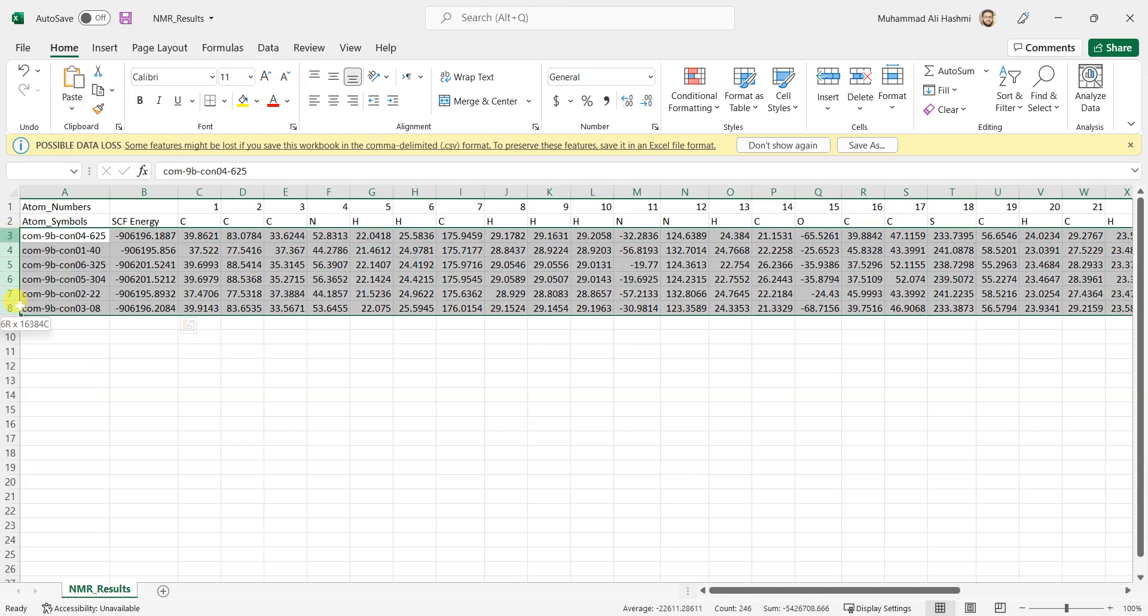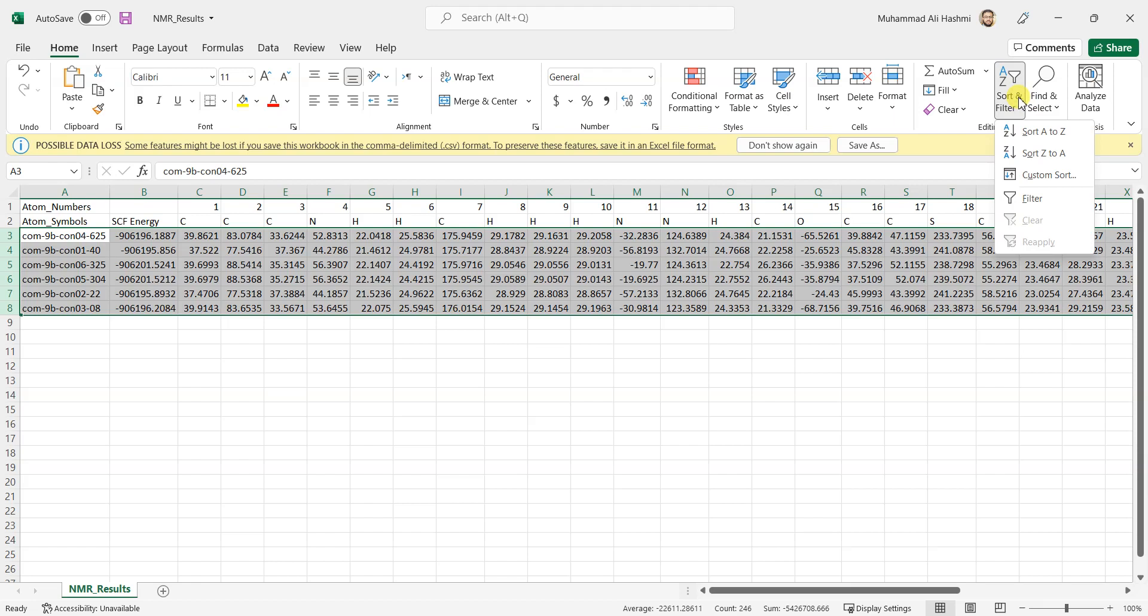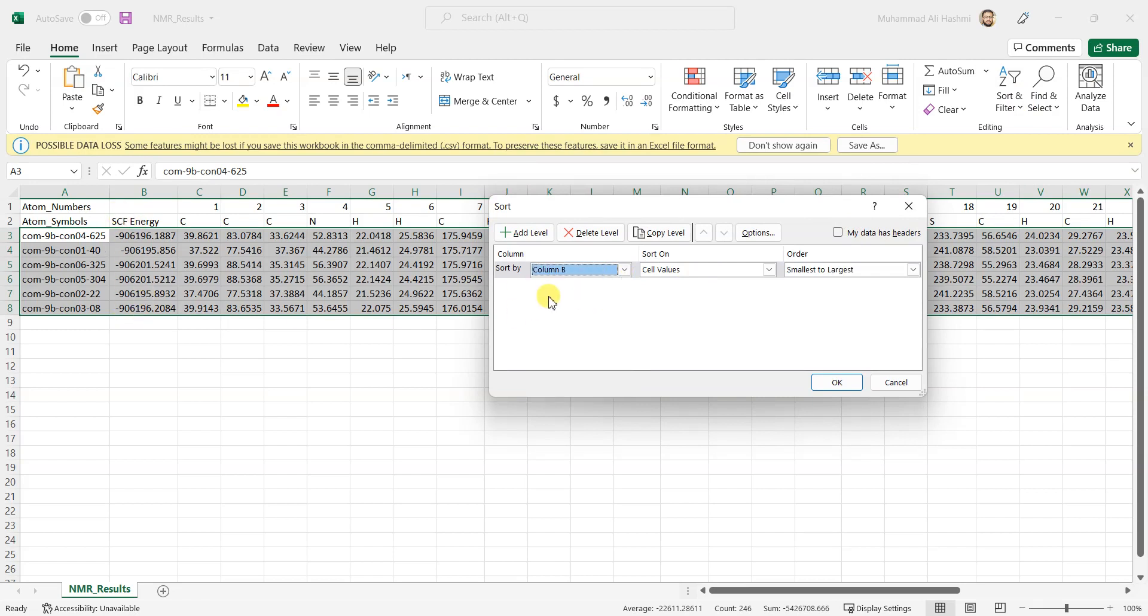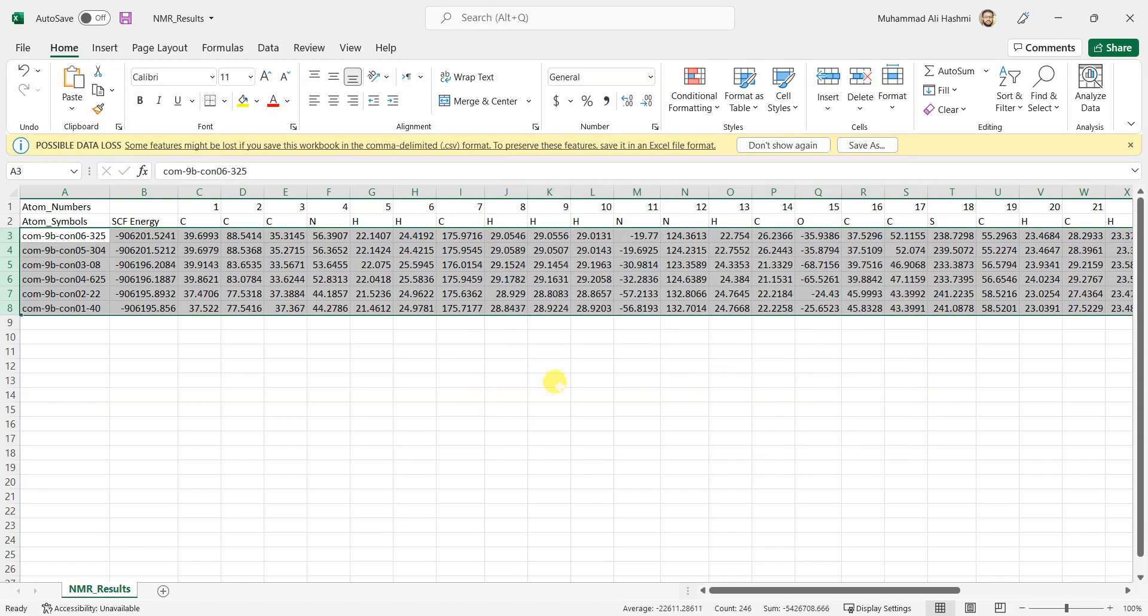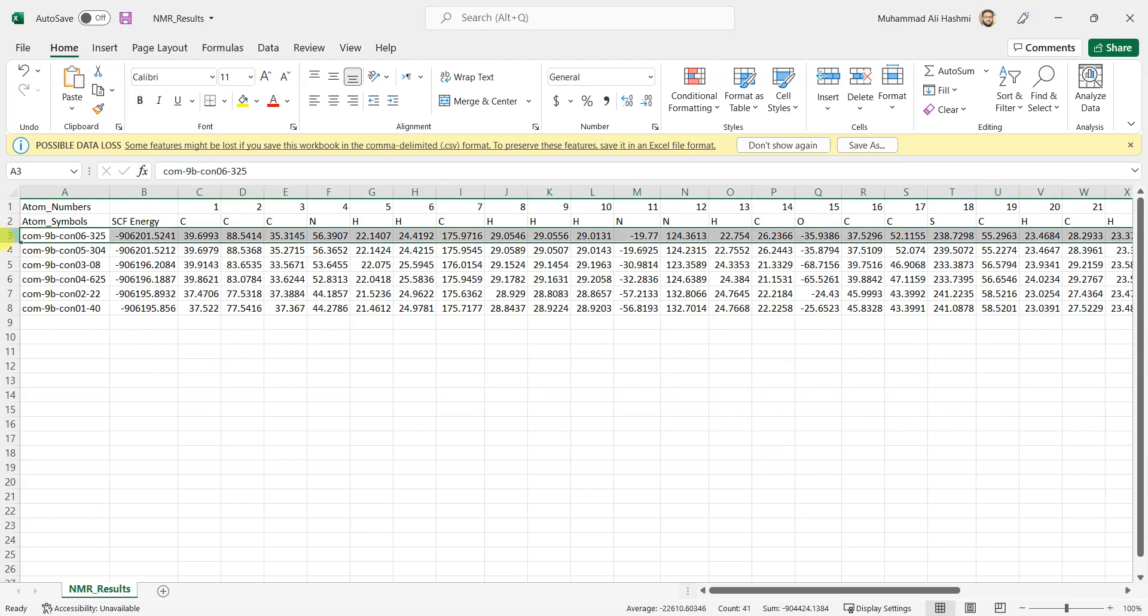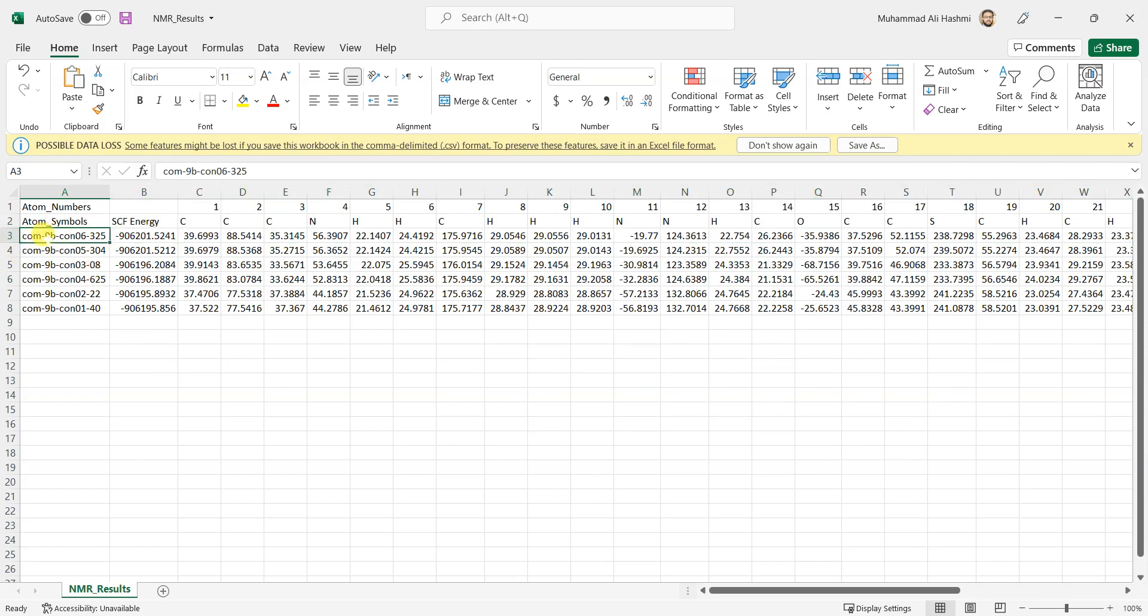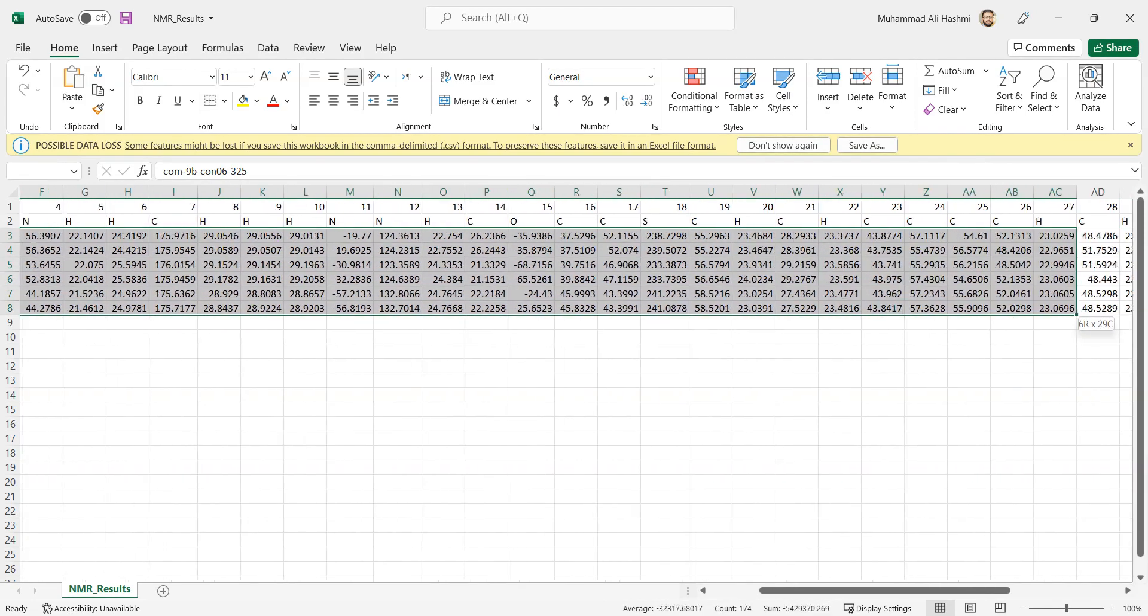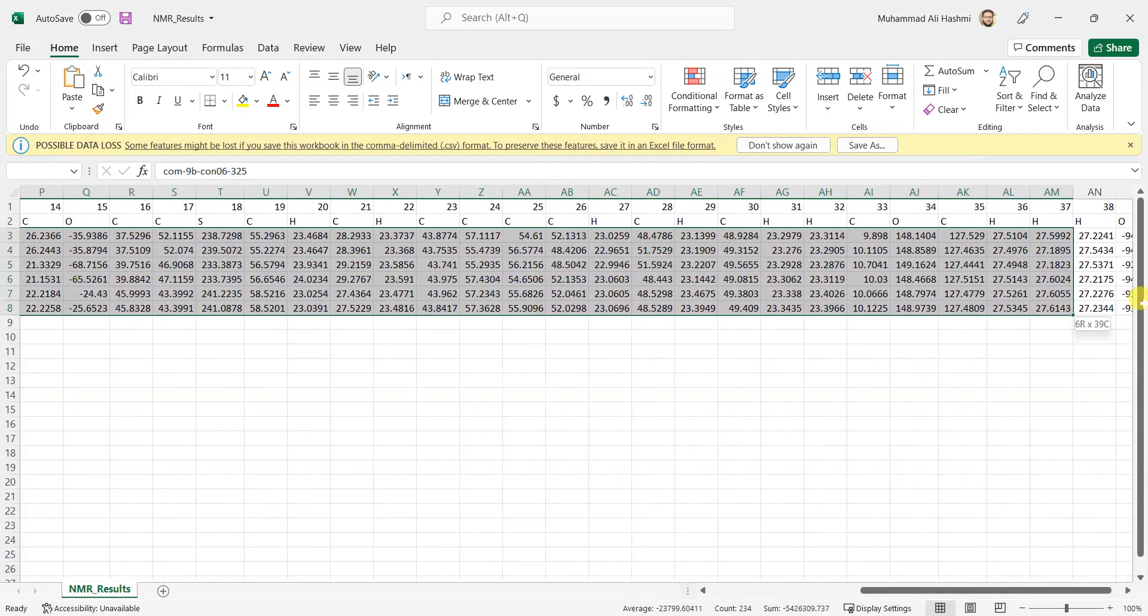What I can do is I can just select it and first of all I can rearrange these values according to the SCF energies. If I sort it according to column B, which is the SCF energies, from smallest to largest, now you see this is the one with minimum energy and then that one and the next one. So now I have another Excel file where I'll just copy these values. I'll just select all the data.